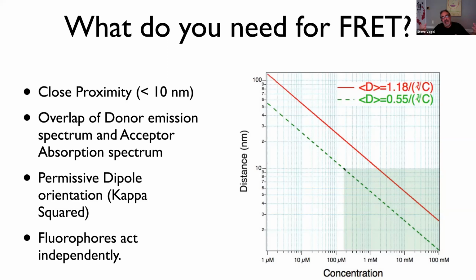So now imagine if you have that and you plop in a donor in that same solution, right? That donor is always going to be within 10 nanometers of an acceptor, not because it's binding to it, but because it can't escape it. It's everywhere. It's like putting one person into a crowded elevator with other people. Of course it's going to be close to those other people.